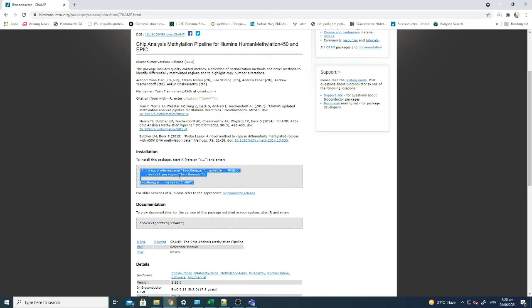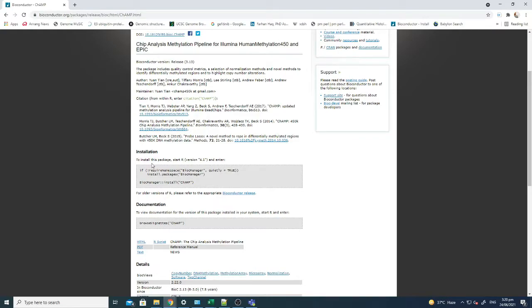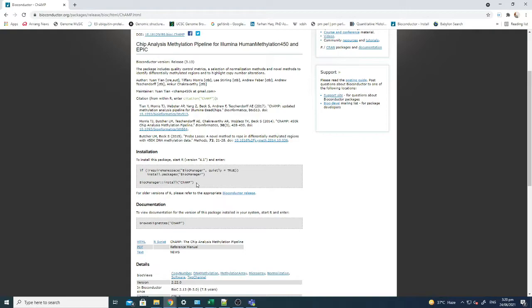Most of the time it does not give any error, but sometimes there's a possibility that some packages may not be installed using the same command on one computer, or it gets installed completely on another computer. So you should know how to find those errors in your script. I'll show you how in the next step, and I'll show you how CHAMP gets installed.